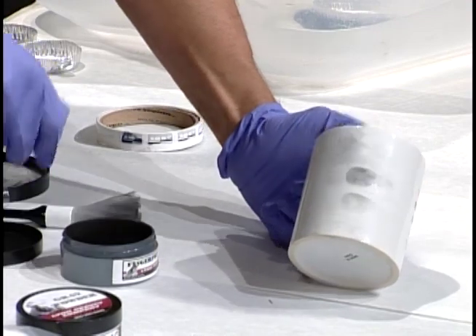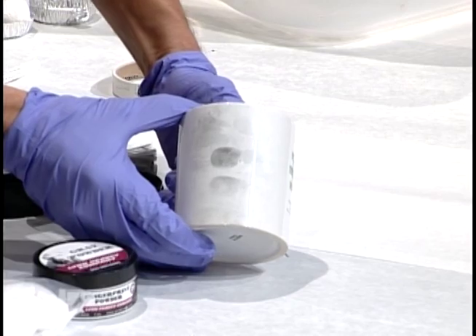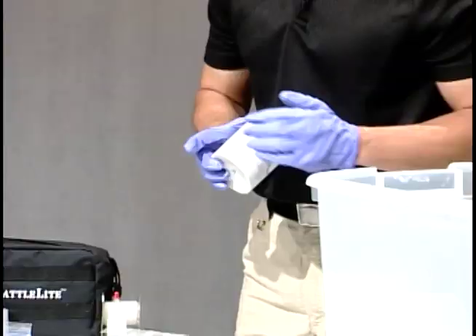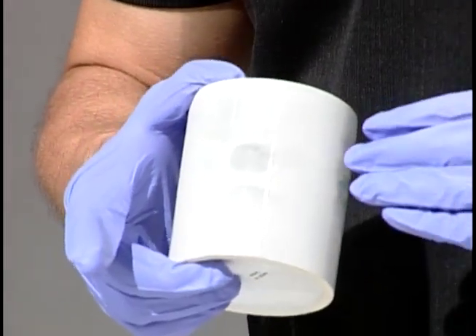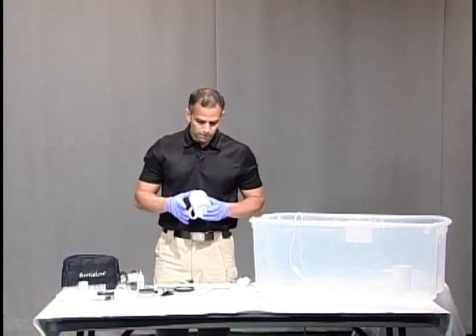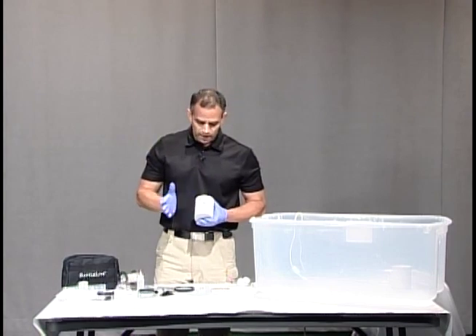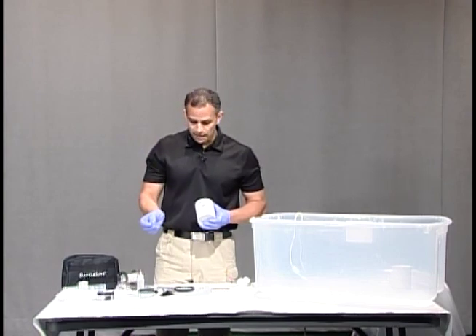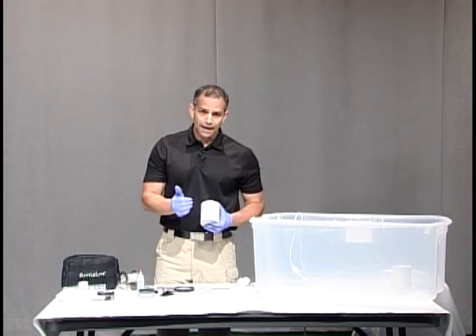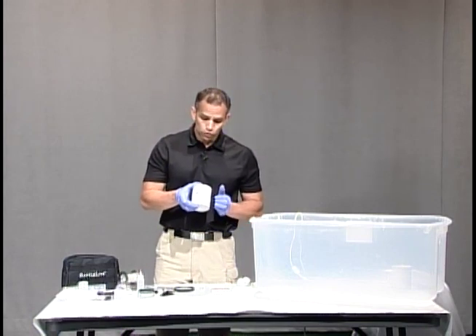Now that we have a little bit of dust on our brush I'm going to go ahead and very lightly spin my brush. Beautiful — you can see lots and lots of ridge detail. Yes, I planted these prints on here so they're going to be fully developed, but even in a regular crime scene you're going to be able to get some ridge detail if it's there. The nice thing about this is if I did make a mistake and used too much powder, I would be able to lift it and reapply the powder and try again because I fumed the print to the cup.